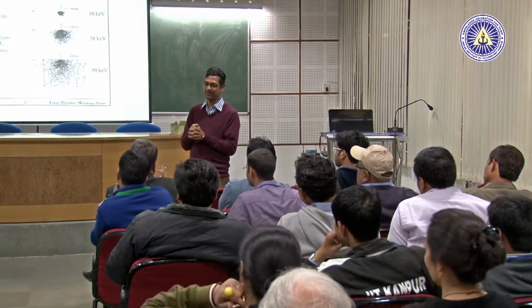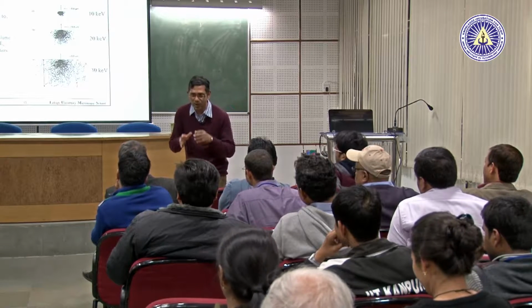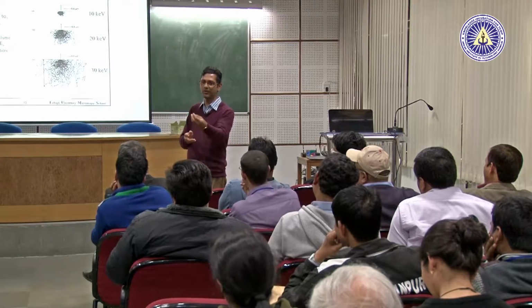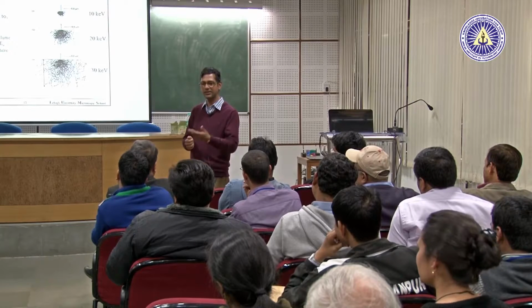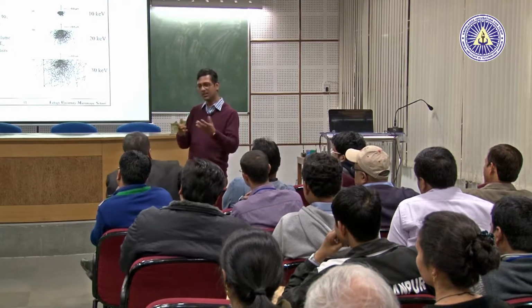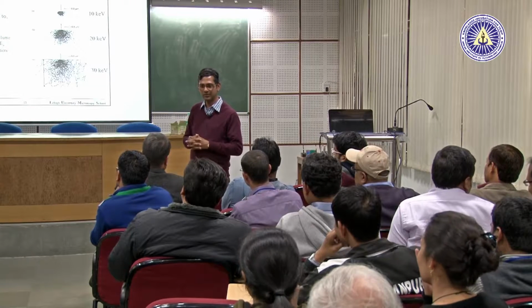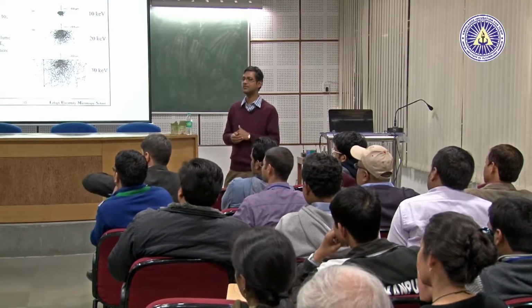And in the case of EDS, can we detect the molecule? You mean to say the composition of the molecule? Yes, why not? You can detect the composition of the molecule, because if you have a sample with a particular chemistry present, you can detect its exact composition. For a single phase material, suppose polyethylene is present, it will tell you the composition of carbon, hydrogen and other things. Then you can detect the exact composition, and a formula can be obtained. It's possible.